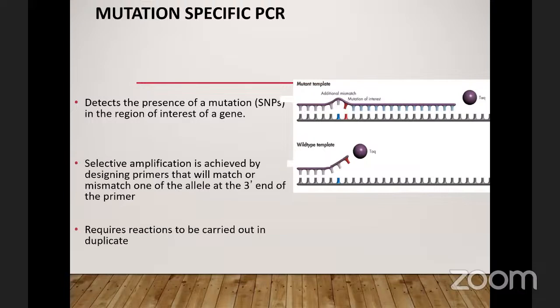Okay, so this other type of PCR, mutation-specific PCR, is a very important type of PCR in research. So for instance, I'm suspecting that, oh, this HRP2 gene. I think I should use this as an example. Most people use RDT, right, to check for the presence of malaria parasites, and you see MP negative, MP positive.